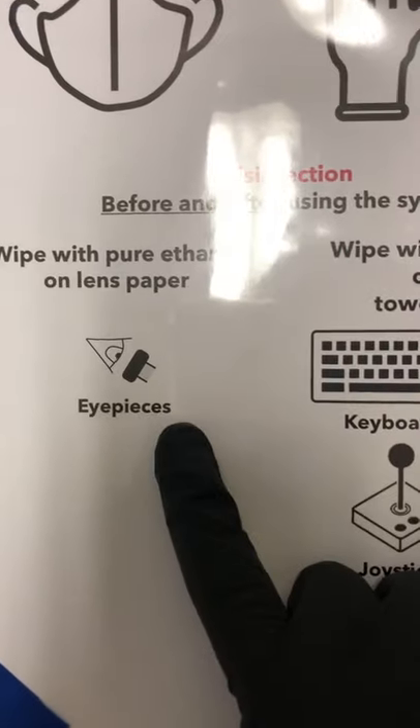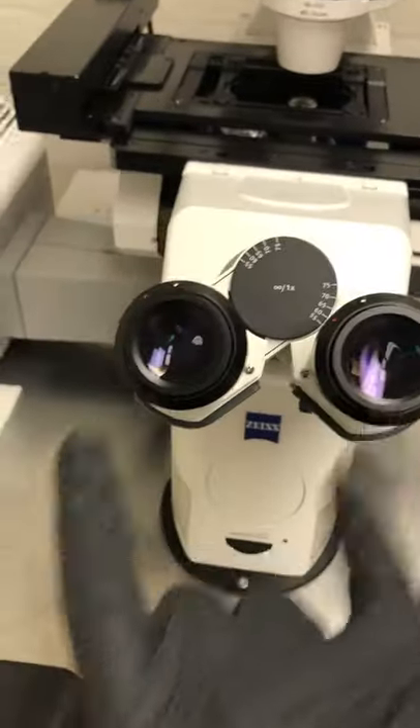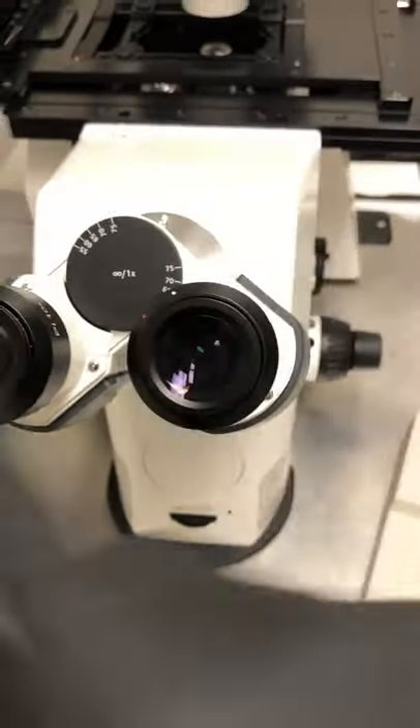We need to wipe the eyepieces with pure ethanol on lens paper. These are the eyepieces, this is lens paper, and you have ethanol in this red bottle. We're going to use lens paper to wipe here and around here.